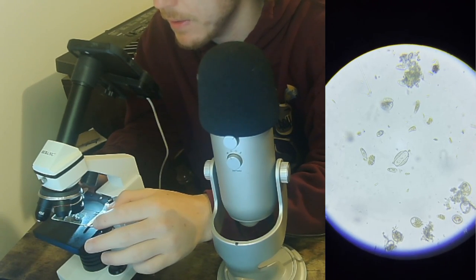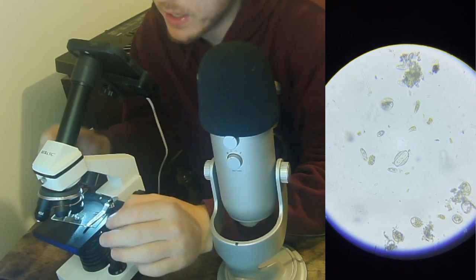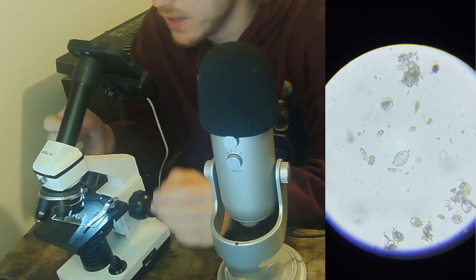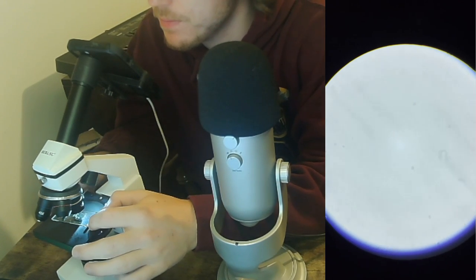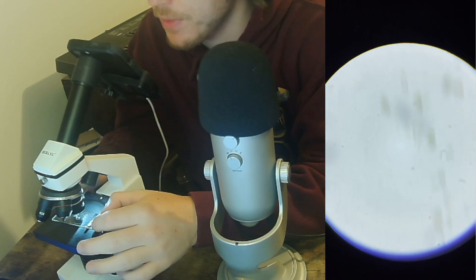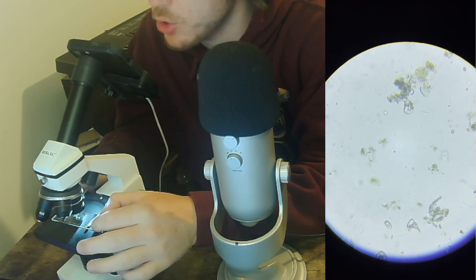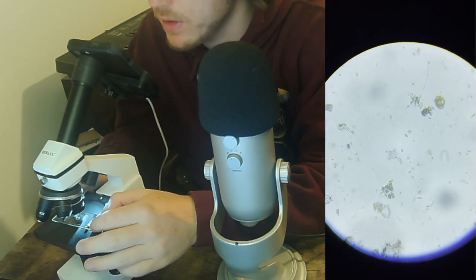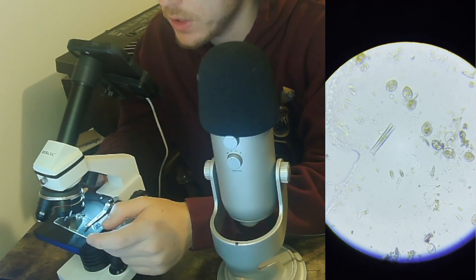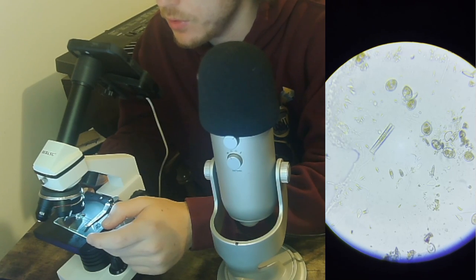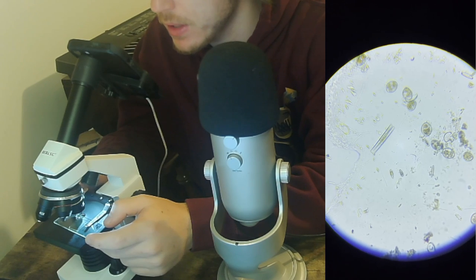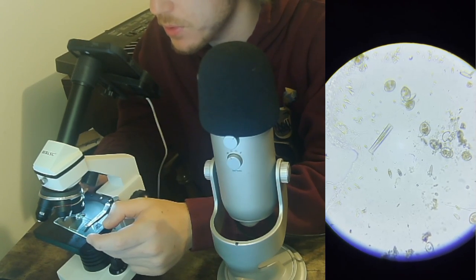Oh look at that! Circular but with like a clear figure eight pattern in the middle. Again, something I've ever seen before. All kinds of new stuff today. Then again, I've only been doing this for a pretty short amount of time, so I guess it's not surprising that I'm always coming across new things.